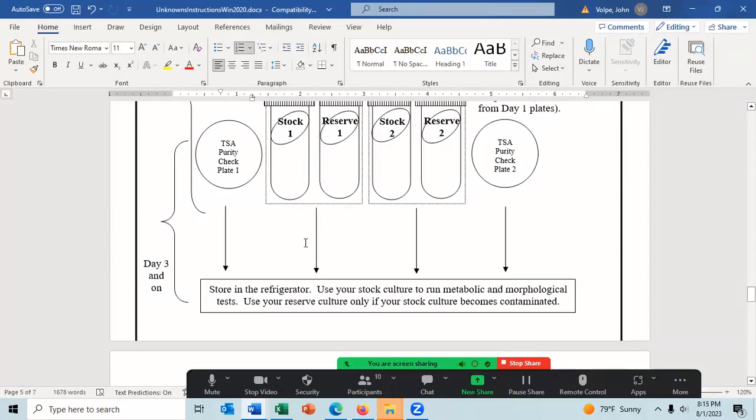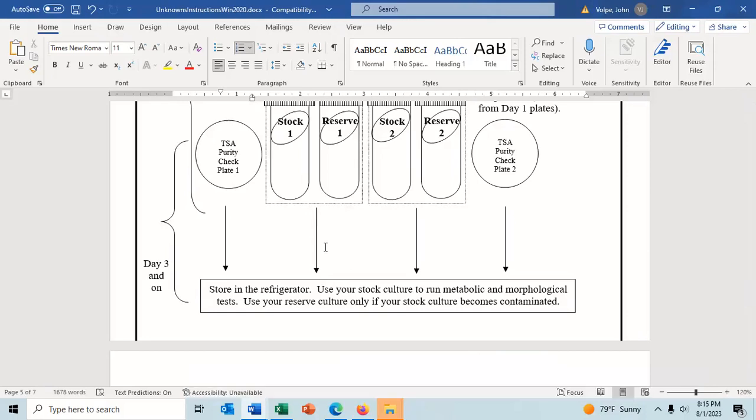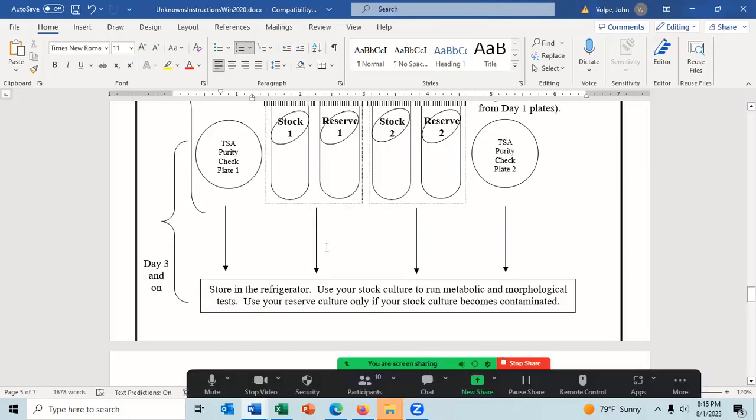I will then incubate it for you, and after the incubation time, I will send you the results. I'll send you a picture of the results. You will then look at the results, record the results, and make your interpretations of the results, and that will be your conclusions. Then you write all of that up in your unknown notes pages, and write the species under consideration after that test. And if needed, write down your next test request at the bottom of your unknown notes pages.